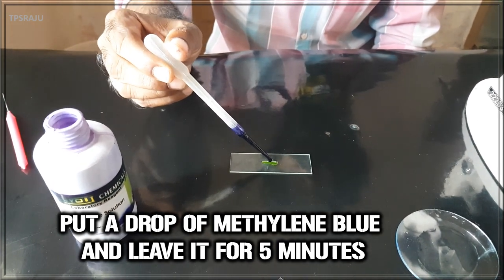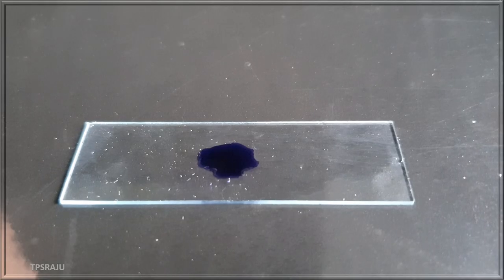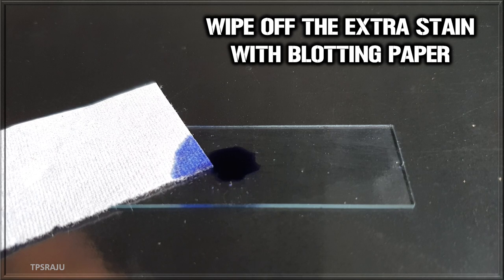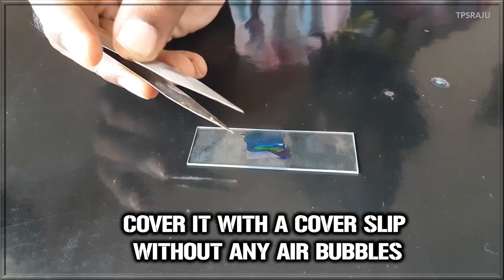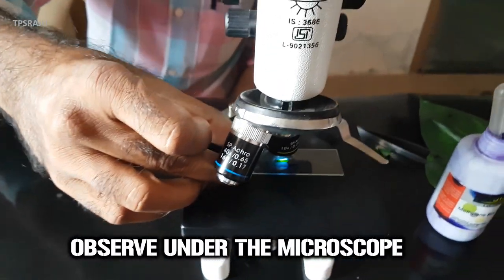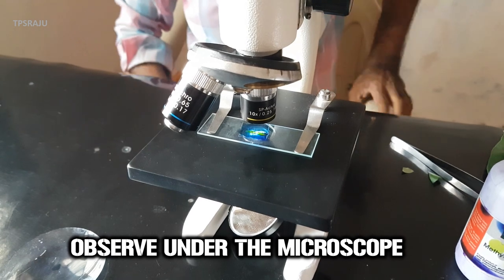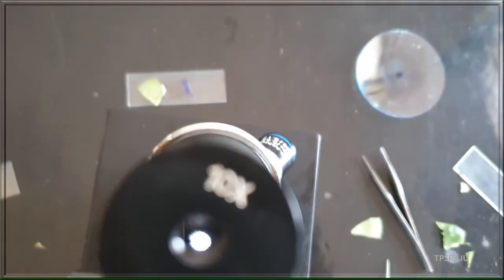Put a drop of methylene blue and leave it for 5 to 10 minutes. Carefully wipe off the extra stain with the help of blotting paper. Cover it with a cover slip without any air bubbles. Let us observe stomata in beetle leaf under the microscope. Carefully observe the stomata in beetle leaf.